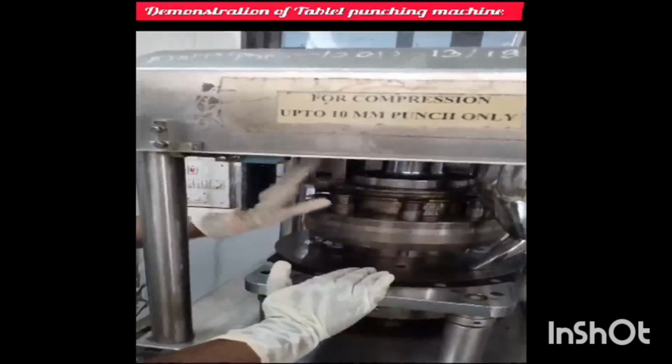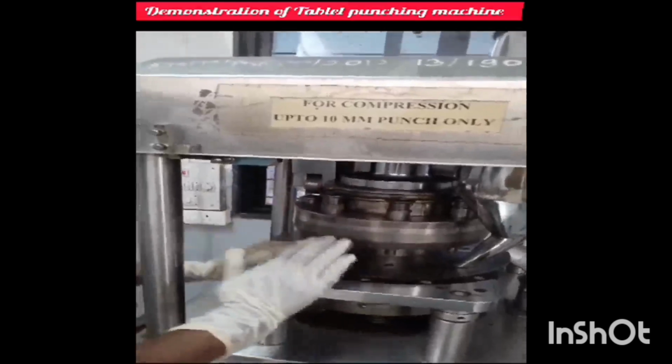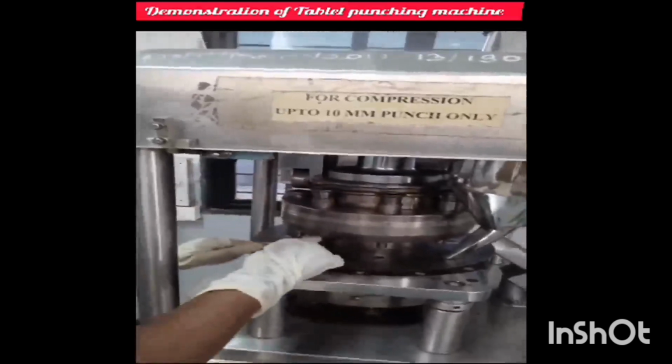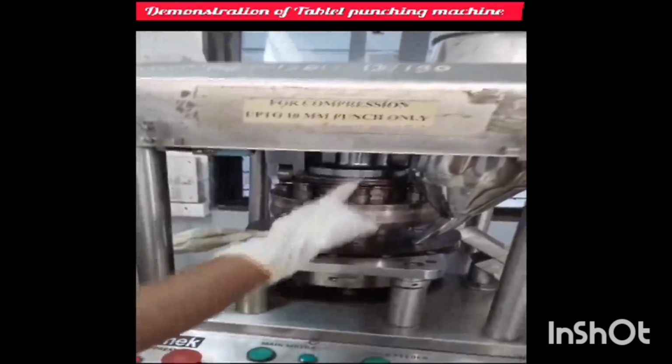Here is the cam mechanism. This cam mechanism helps to rotate the dies and punches in a uniform manner so that the upper punches and lower punches synchronize and the movement is up and down.